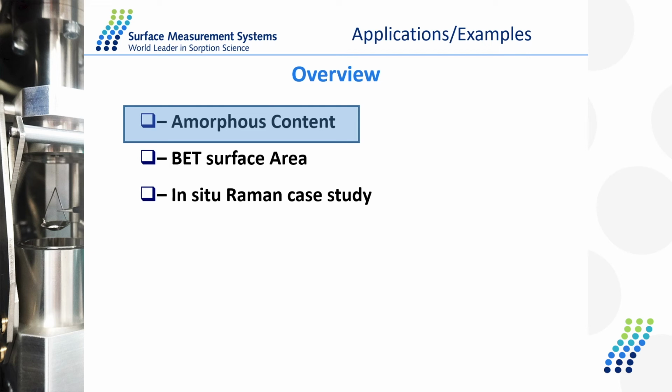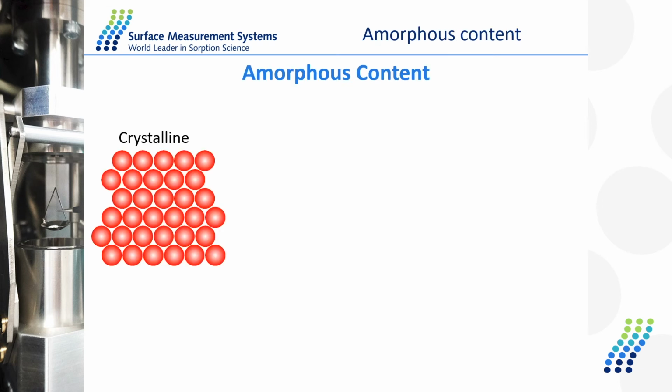What I'm going to do now is a more focused study on our amorphous content, and then go over to the other section of our presentation. So let's start with amorphous content.